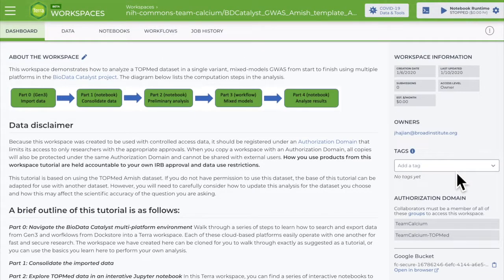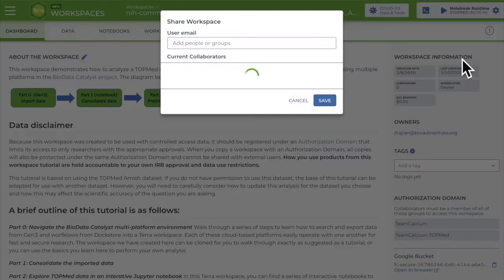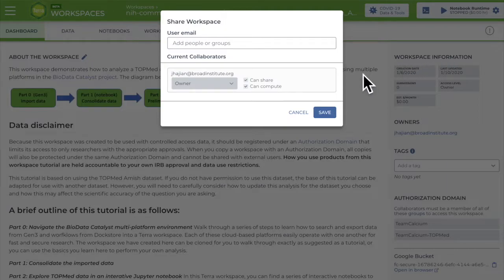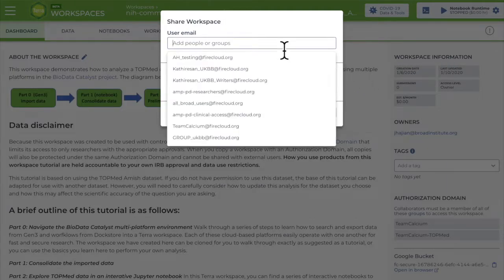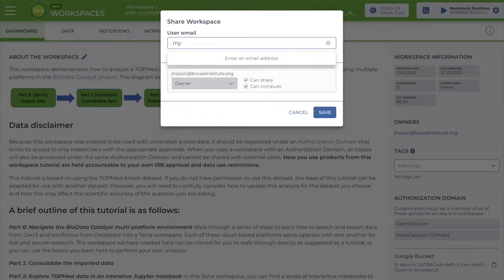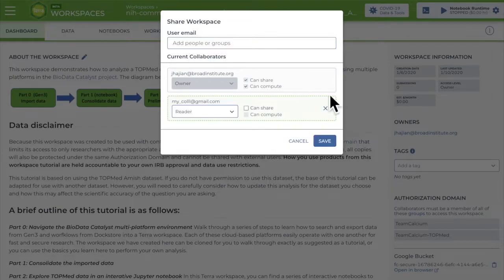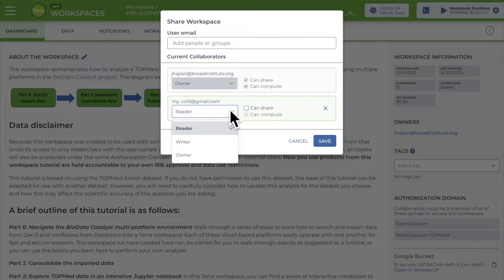When you're ready to share a workspace, click on the three vertical dots at the top right of any page and select Share. You'll get this Share workspace form to complete. First, you'll add your collaborator's Terra user ID and hit Return. Then to control what each collaborator can do in the workspace, whether they can run computations or share with other people, for example, you'll set a role for each person you shared with here. Roles include reader, writer, or owner, and you can change these settings later.